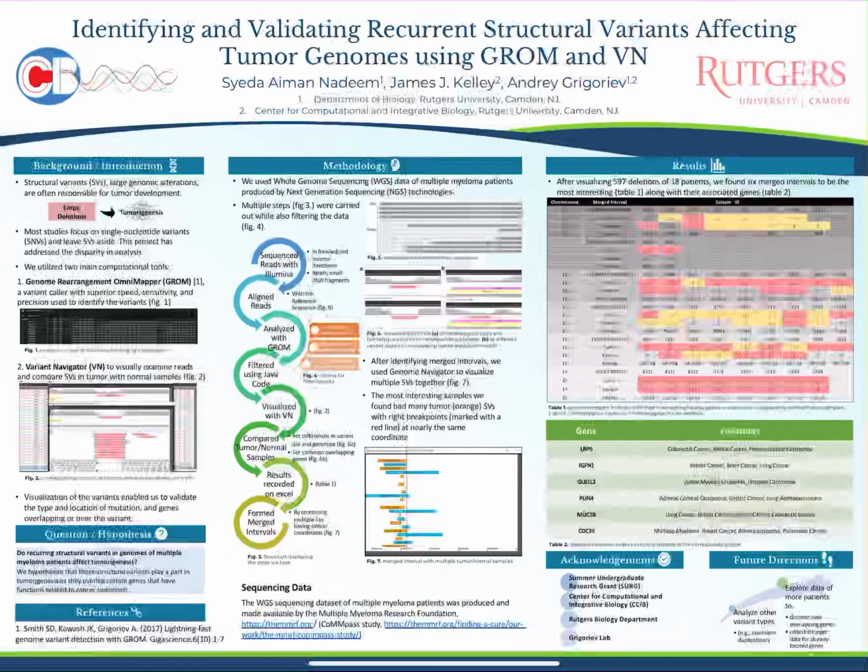Hi everyone, my name is Aiman, and in my project I'm visualizing the recurrent structural variants that are affecting tumor genomes using GROM and Variant Navigator.